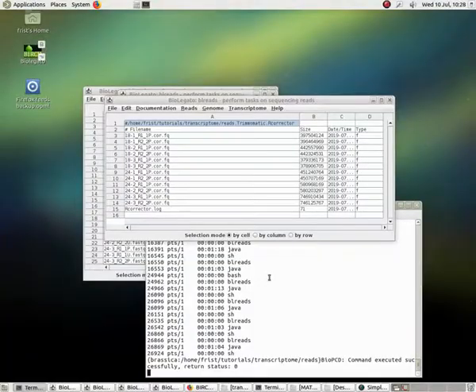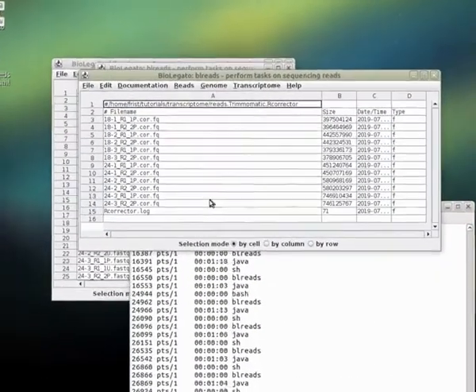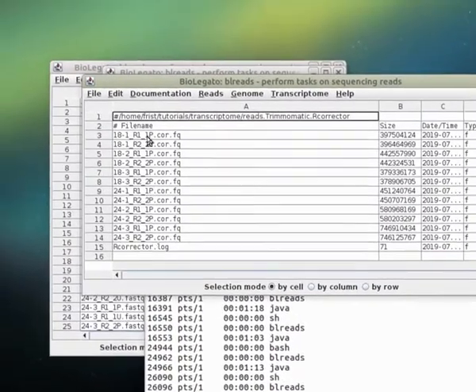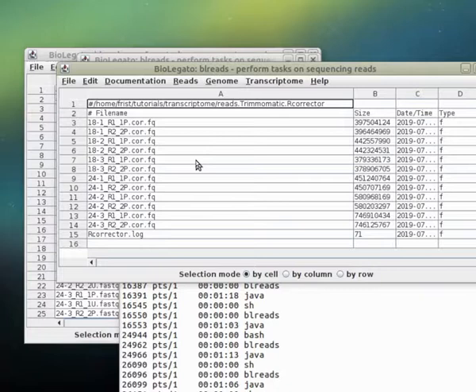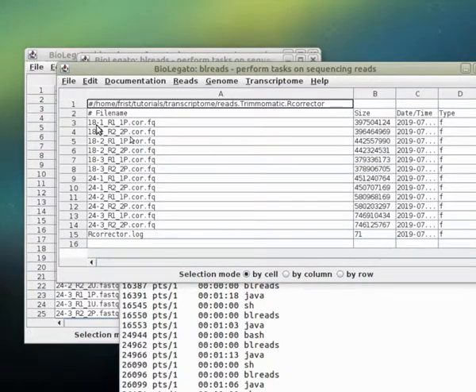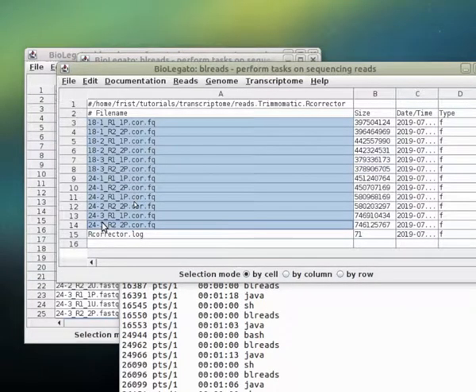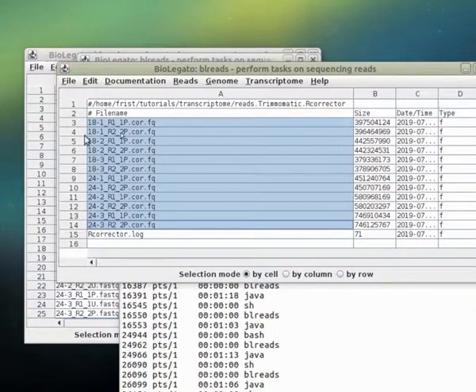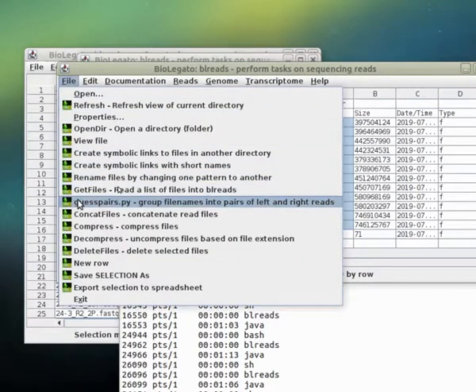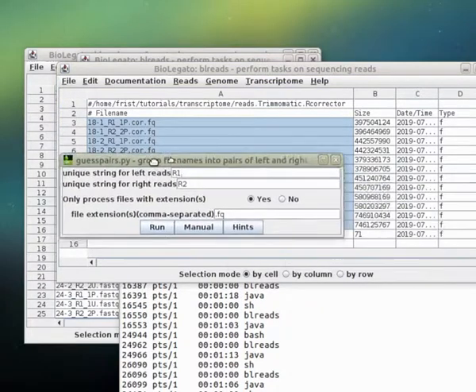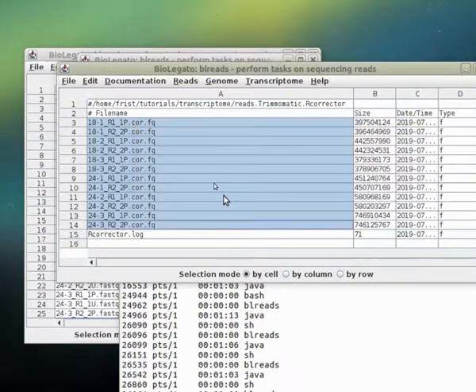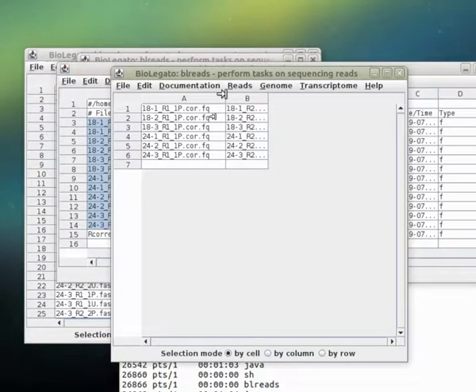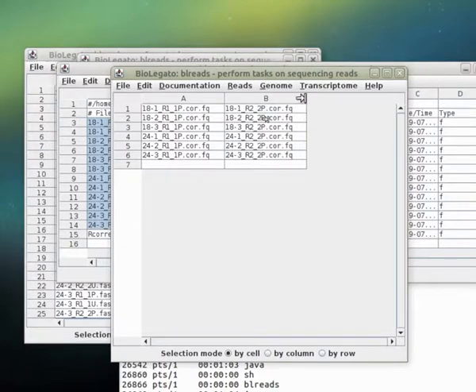Now you can see a new BL reads window with the corrected reads. All of them have the .cor.fq file extension, and these are in the reads.Trimmomatic.Rcorrector directory. The next step now is we can finally do our transcriptome assembly. We first have to group the files once again using Guess Pairs, and we use the .fq file extension to group them. Now we've got our pairs of corrected read files ready for the assembly.